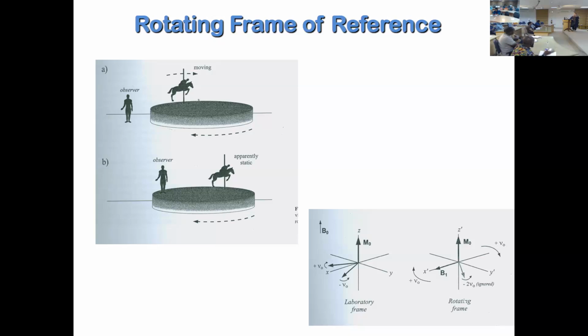Otherwise, if the detector is not moving and is standing outside, like a human eye, it is nearly impossible to differentiate between the speed of two protons. We are talking about protons right now, but this is the case for each nucleus. That is the concept of the rotating frame of reference: the detector has to move, like you.